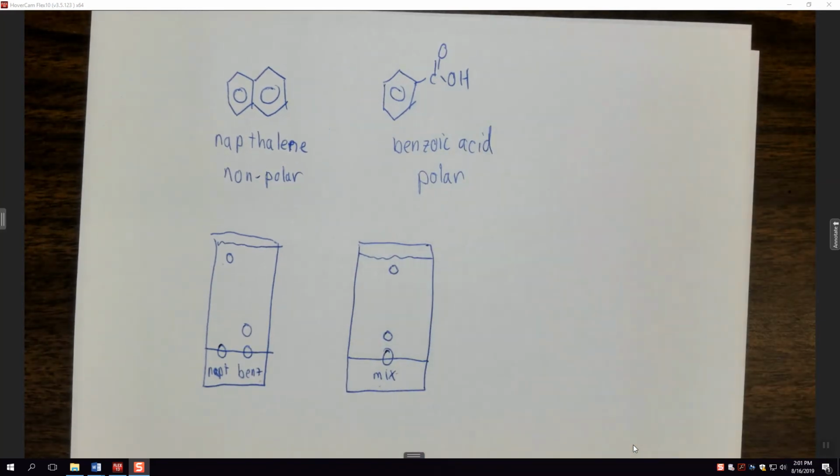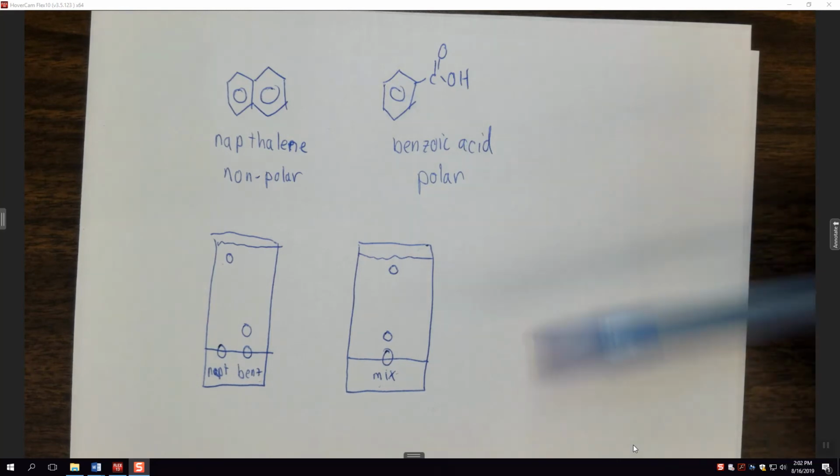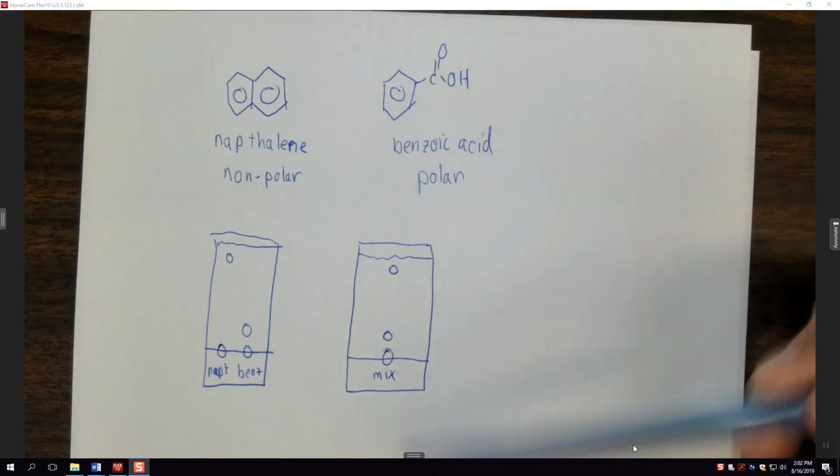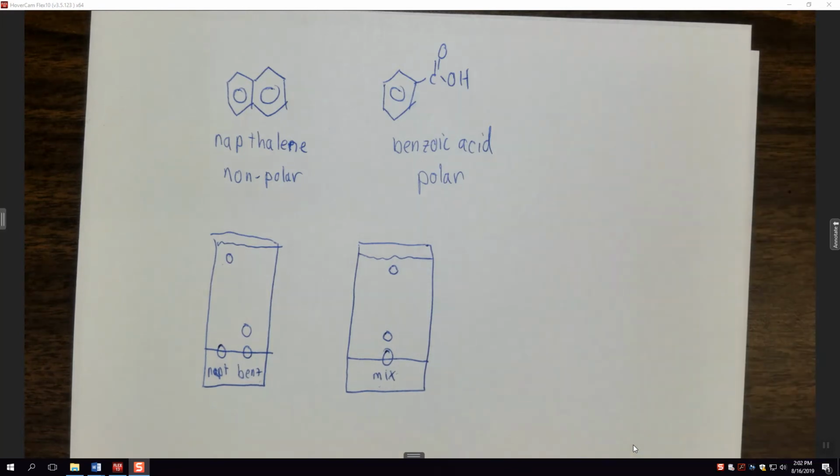It's also important to note that when you're doing TLC, you have to always use a pencil. A pencil is made out of carbon, and the carbon will not dissolve in the solvent. So essentially, it'll just stay. If you make a line, it'll stay. If you use ink, ink is made out of molecules that can elute on TLC. So if you use ink on a TLC plate, you're going to make a mess. In fact, on purpose, in another experiment in this course, you will use ink as a way to analyze the ink samples.